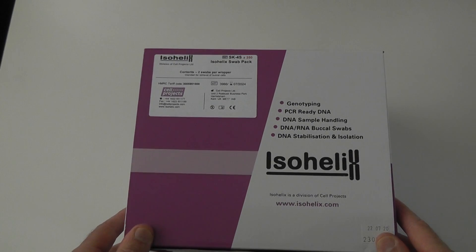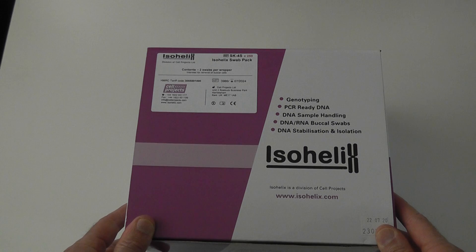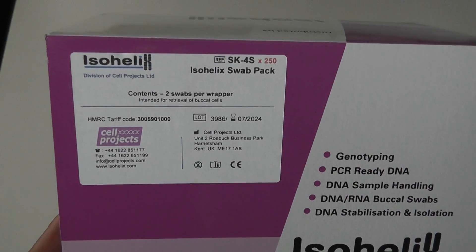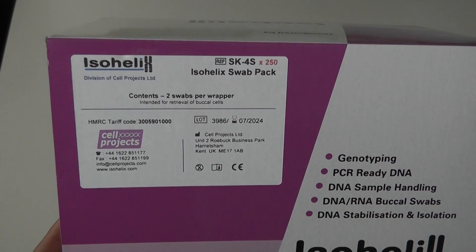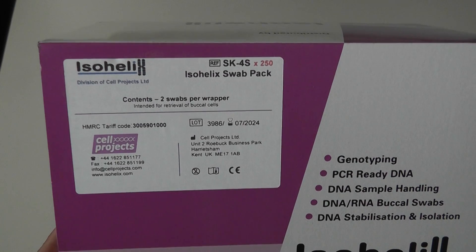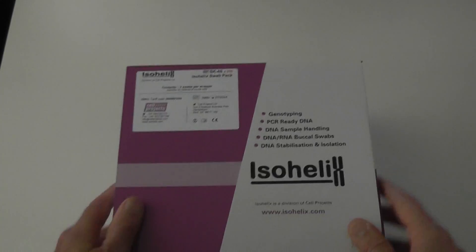Quick presentation of the SK4S swabs from ISO Helix. There are 250 swabs in each pack, and the swabs are individually packed without tubes — you just get the swabs in this one.